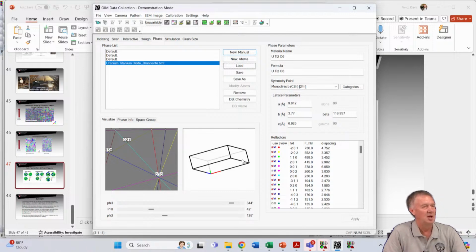I don't know much about it. I sit in meetings and I say, oh, that's pretty neat. Yeah, you're looking at forsterite, that's cool. And I've done a lot of measurements for people like that, and they'll send me stuff and say, put this rock in your SEM. I say, okay, I'll do it. And measure something and send it. And then they can do the analysis and comparison. But I've never learned that stuff. But yeah, if you look up geology or geologic formations and fabrics, you'll see a lot of this stuff.